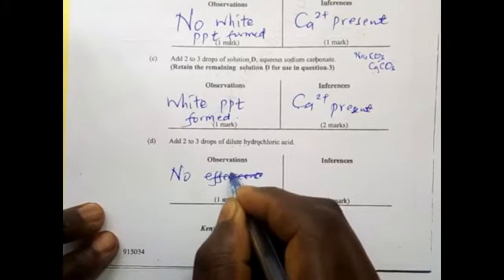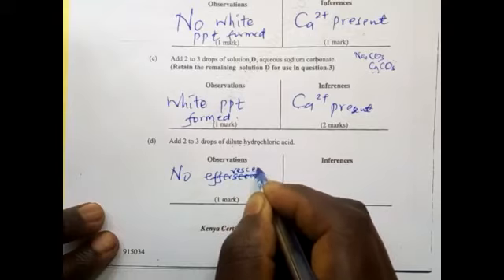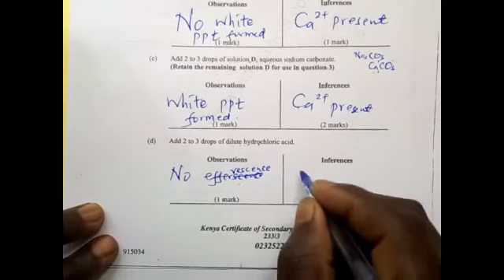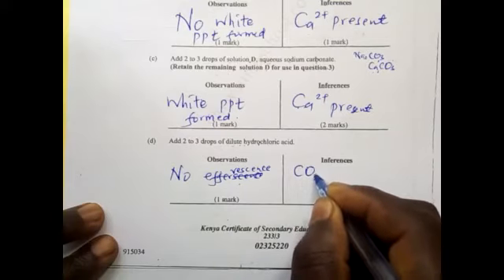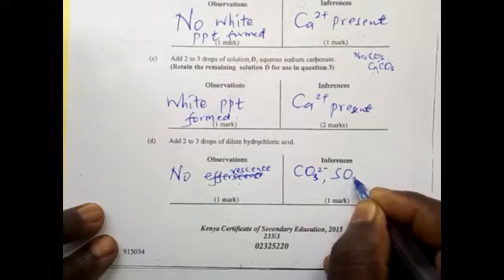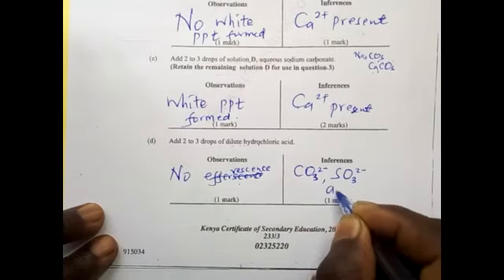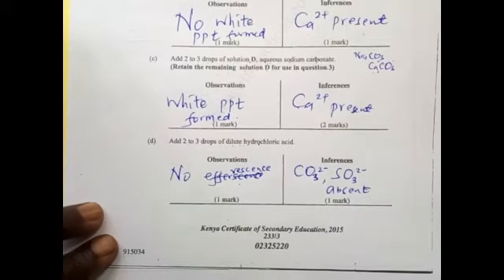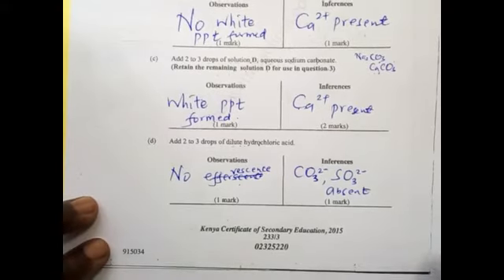If there is no effervescence, it means that the carbonate and the sulfite are absent.